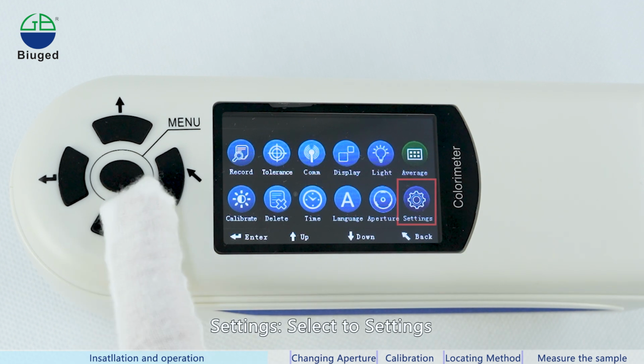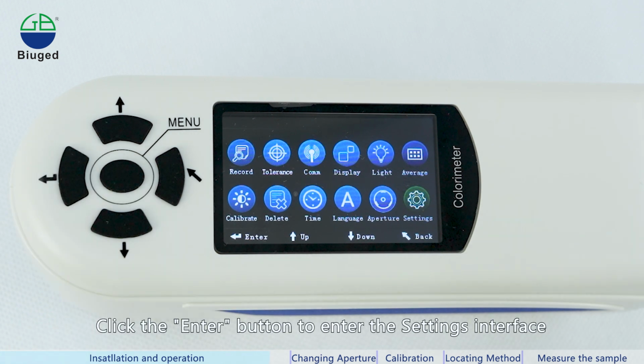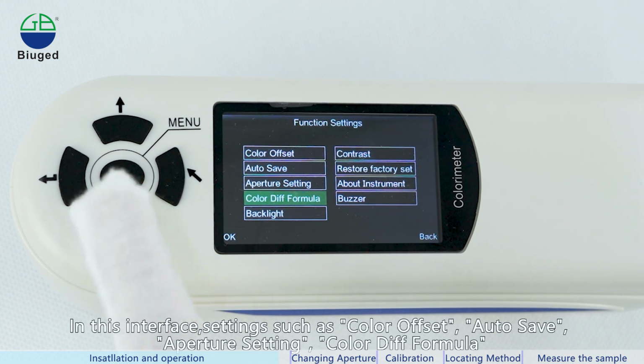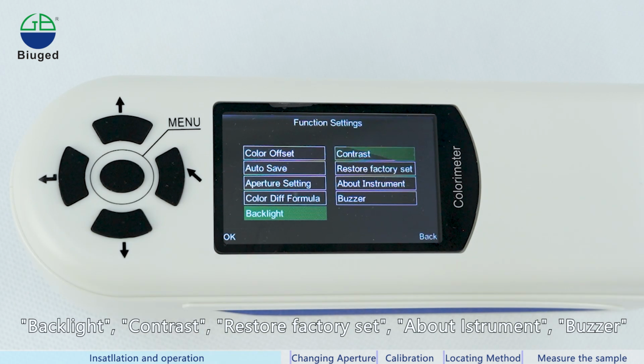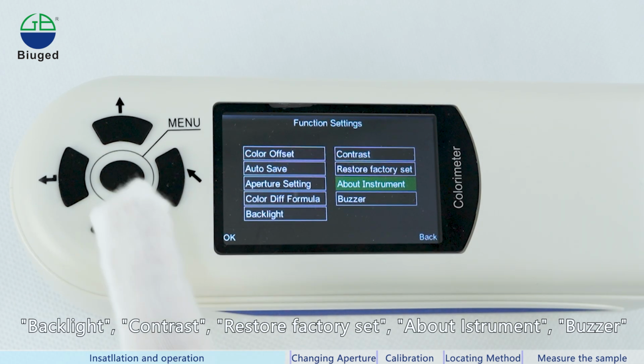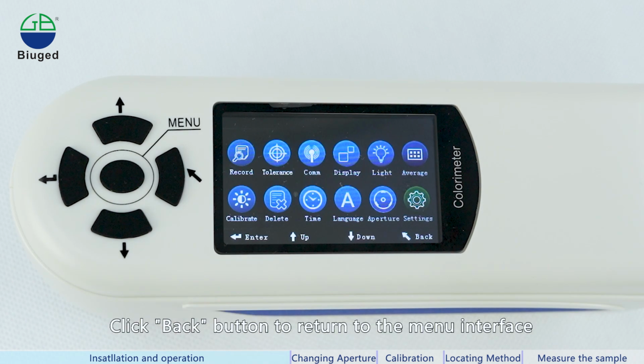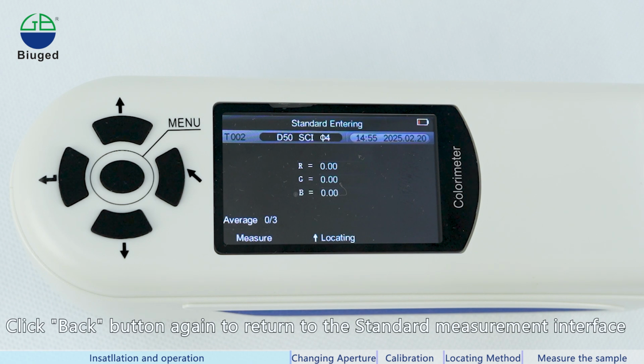Settings, select Settings. Click the Enter button to enter the Settings interface. In this interface, you can adjust settings such as color offset, autosave, aperture setting, color diff formula, backlight, contrast, restore factory set, about instrument, and buzzer. Click the Back button to return to the menu interface. Click the Back button again to return to the standard measurement interface.